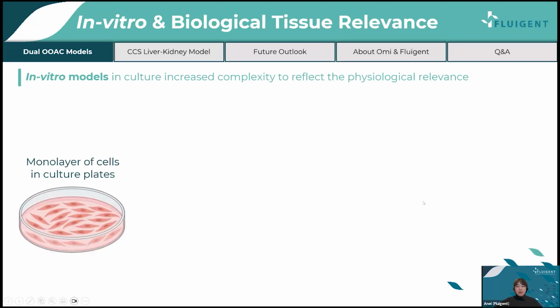They offer simple but sometimes limited physiological relevance, and are also suitable for co-culture of different cell lines. Then we increase the complexity with transwell or permeable membrane systems that allow two layers of cells to be cultured separately while enabling diffusion of soluble factors, widely used for barrier models.